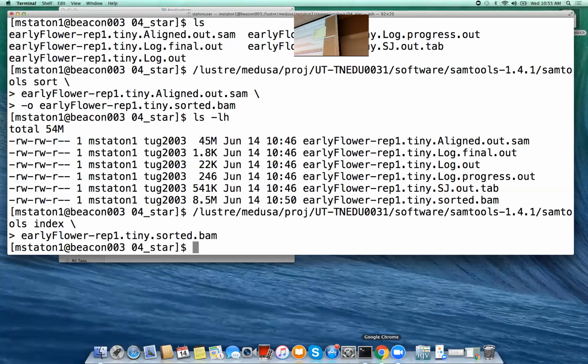Now you can see the A, C, G, T like what you showed. You have to zoom in. If you zoom way out, there's too many bases to display. So if you zoom in, that's the chromosome. You're going up and down on the chromosome.